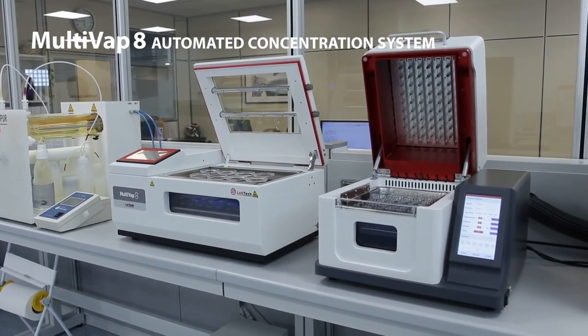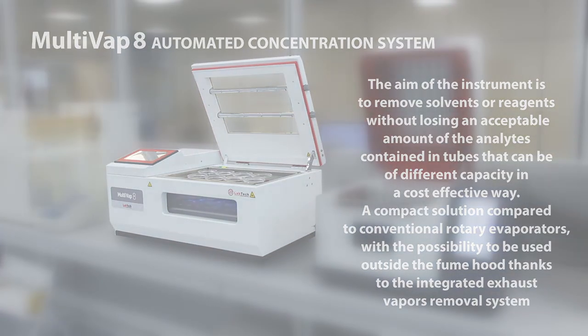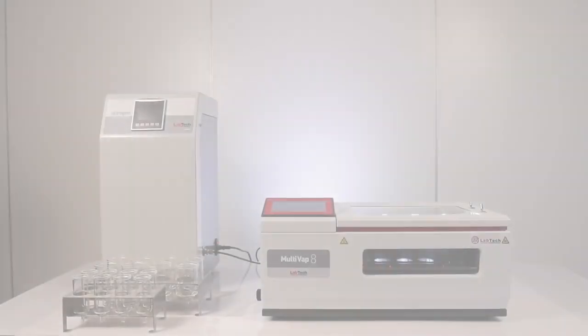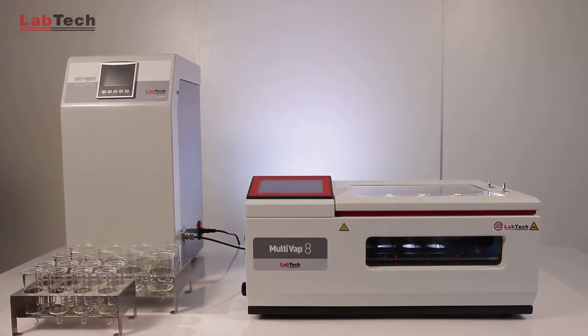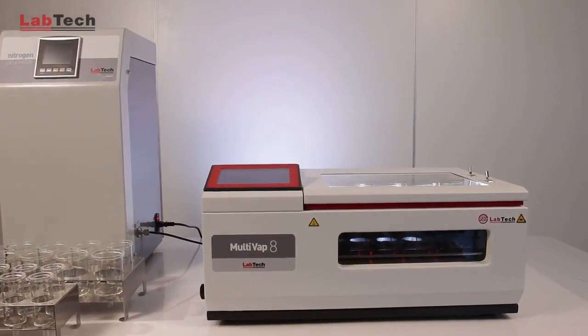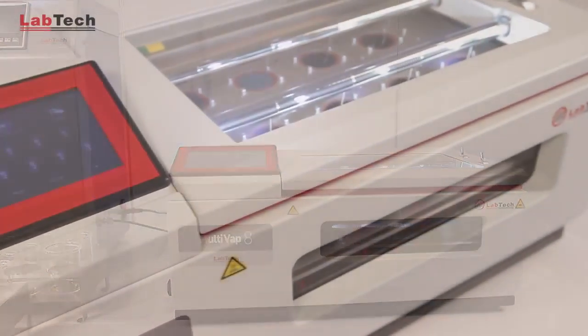Take for example the Multivap 8. The aim of the instrument is to remove solvents or reagents without losing an acceptable amount of the analytes contained in tubes that can be of different capacity, in a cost-effective way. A compact solution compared to conventional rotary evaporators, with the possibility to be used outside the fume hood thanks to the integrated exhaust vapors removal system.